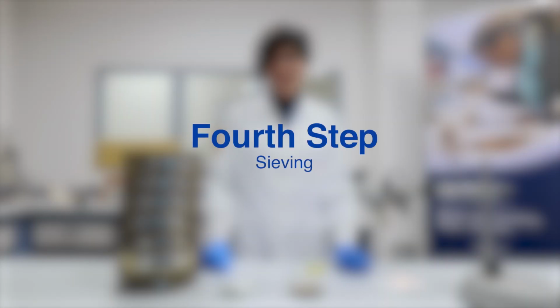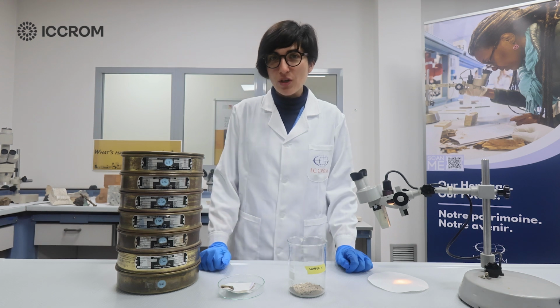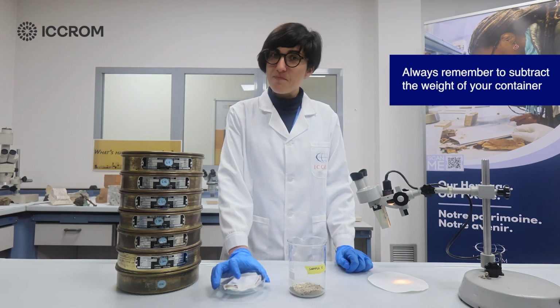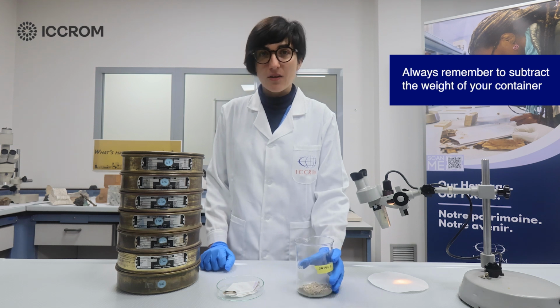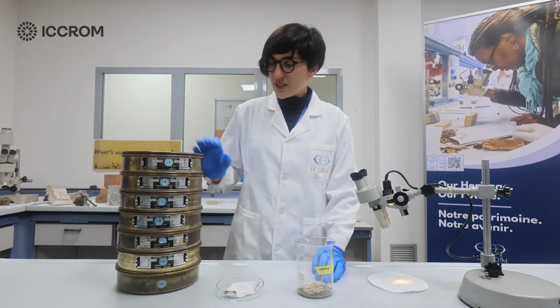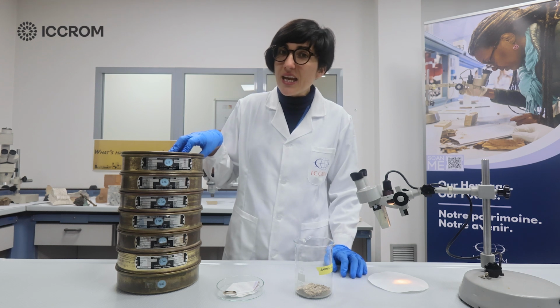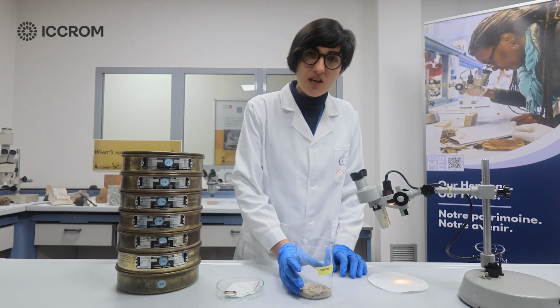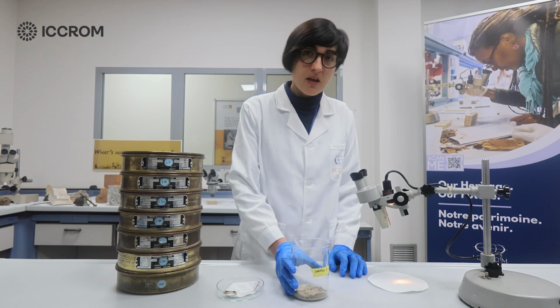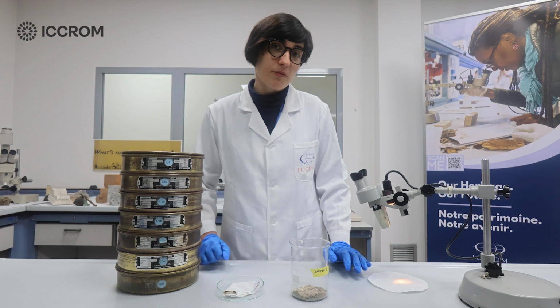24 hours have passed and we have removed our sample from the oven. Now it's time to record the weight of the filter paper that contains your fine particles and the weight of the dry aggregate. Before proceeding with the sieving of the dry aggregate to determine the grain distribution, make sure to do some visual examination of your dry aggregate. Record the shape of the aggregate, record the color, and make observations.